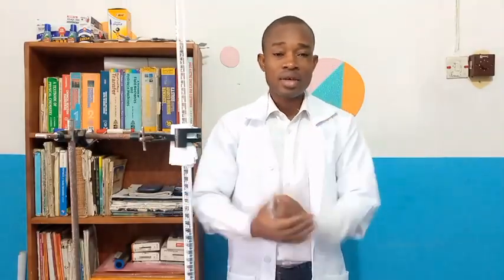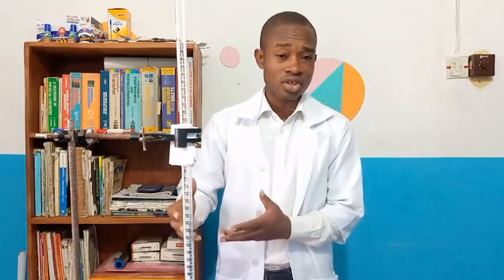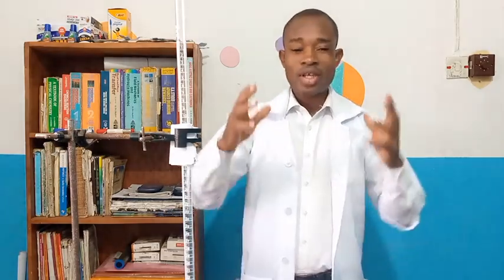Well, in this titration experiment, we are actually going to use potassium tetraoxomanganate(VII) solution and ammonium iron(II) sulfate, a hydrated crystal. Although titration has some other aspects where you deal with things like the percentage purity of a substance, or carry out the neutralization reaction and just calculate the molar concentration and mass concentration, there is this other aspect of titration, redox titration, that is reduction and oxidation reaction titration. And that is the part of titration that this video lesson will be based on.